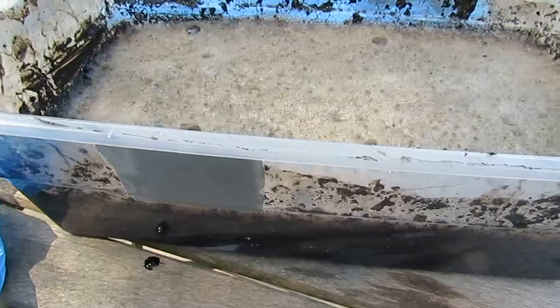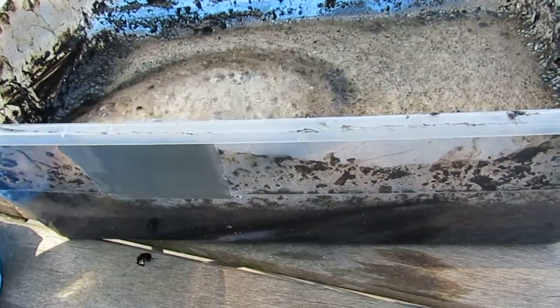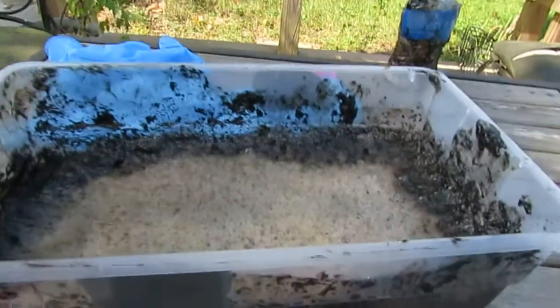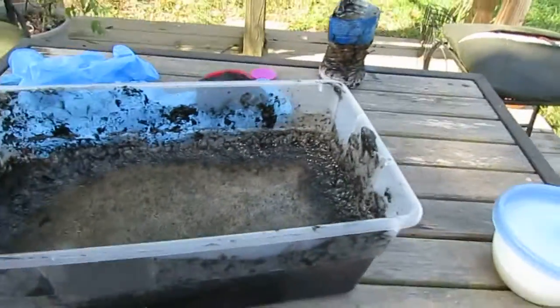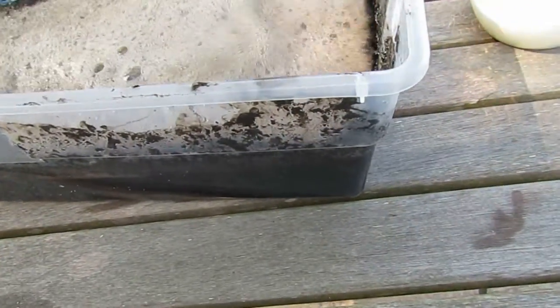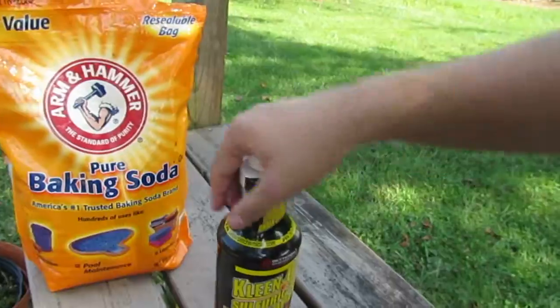First thing I'm going to do is use the rest of this. The reason why I have to filter this is because there is now sodium sulfate, which I kind of want, but at the same time I probably won't use it. I'll keep some of this leftover solution just so I have sodium sulfate, even though I can make it really easily. Sodium bicarbonate and sulfuric acid will make sodium sulfate.